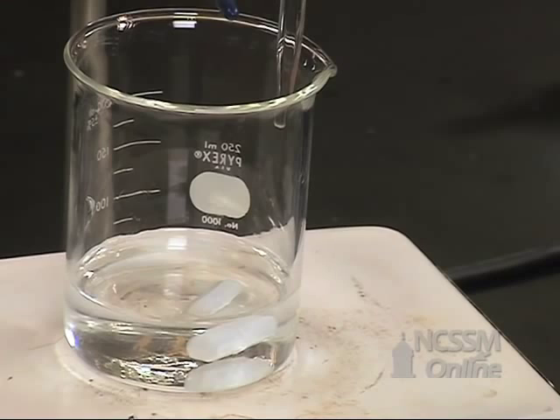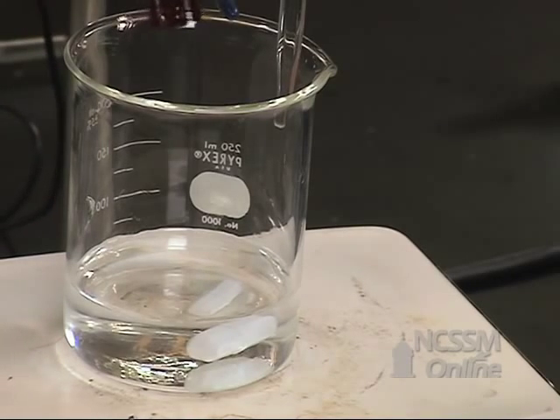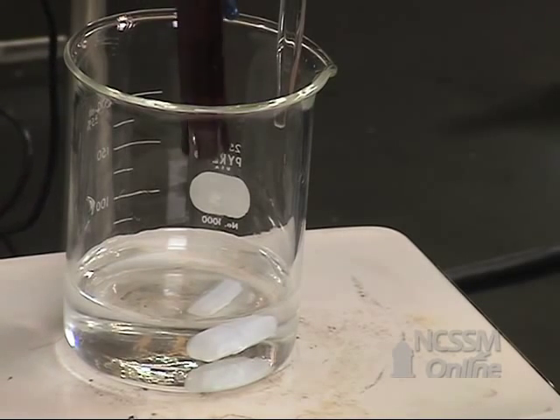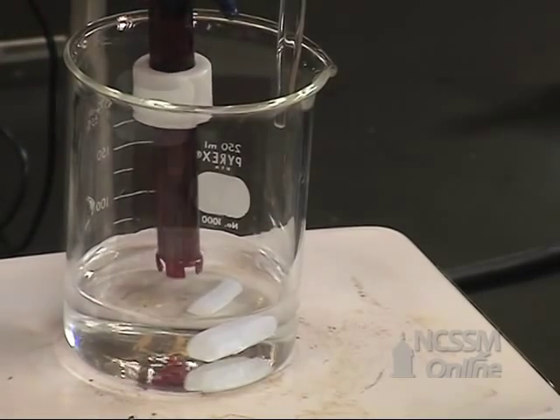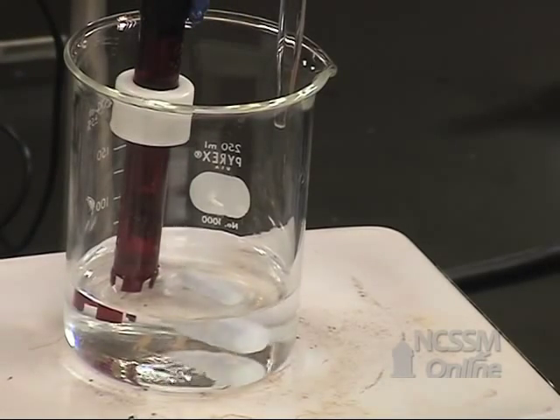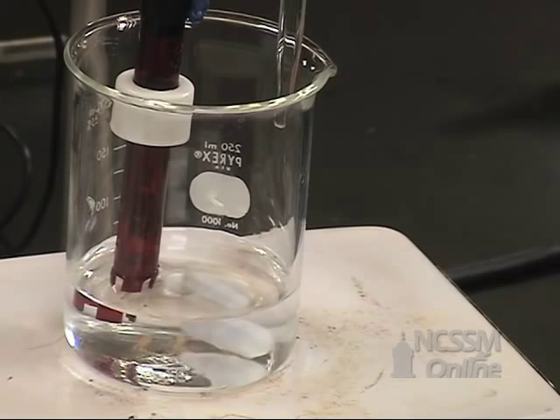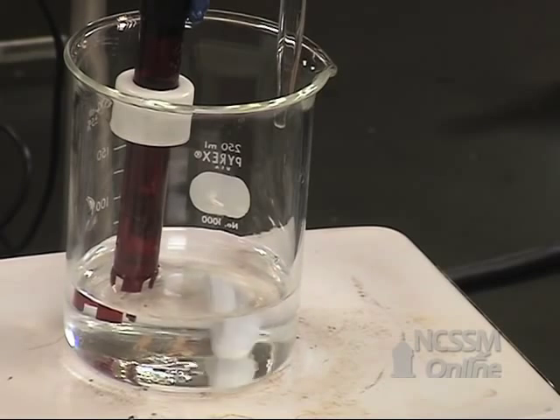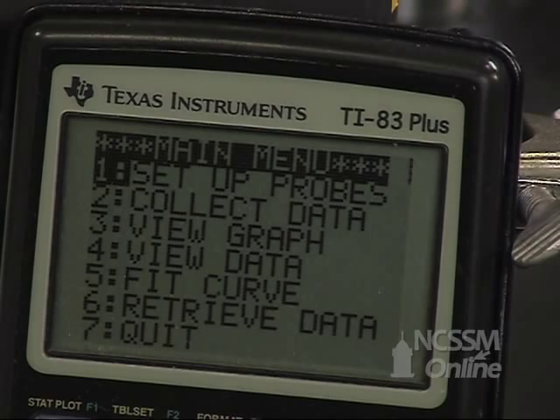We're going to place our calibrated pH electrode into the solution. We're going to gently stir the solution — we want to be careful that the stir bar does not hit the electrode. We've already calibrated the probe, so we're ready to collect data.